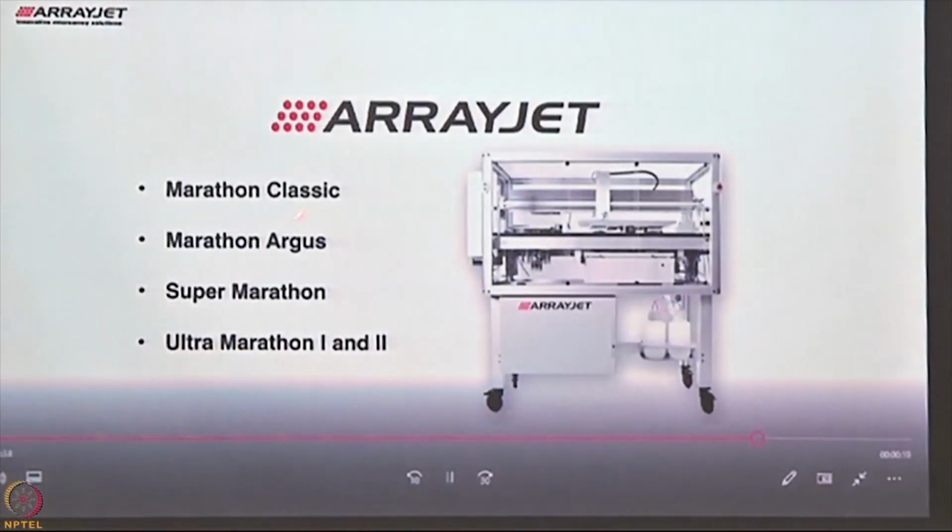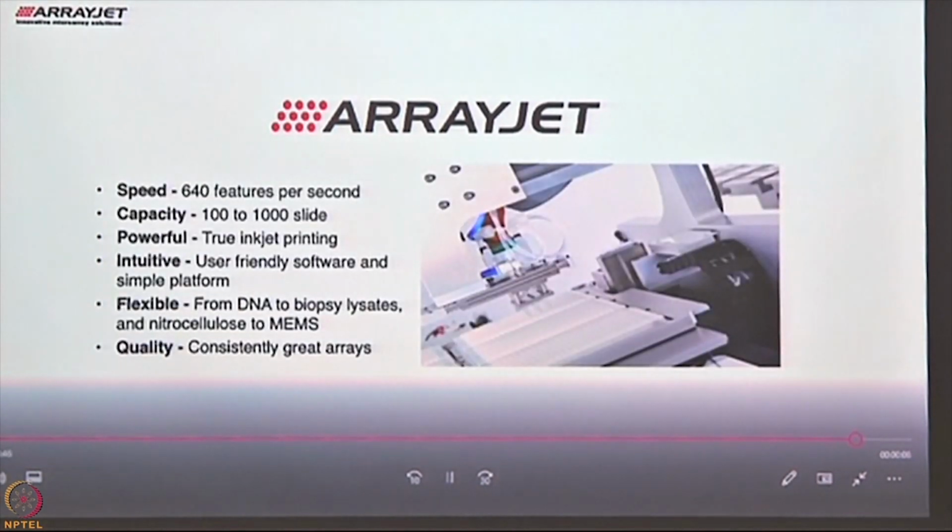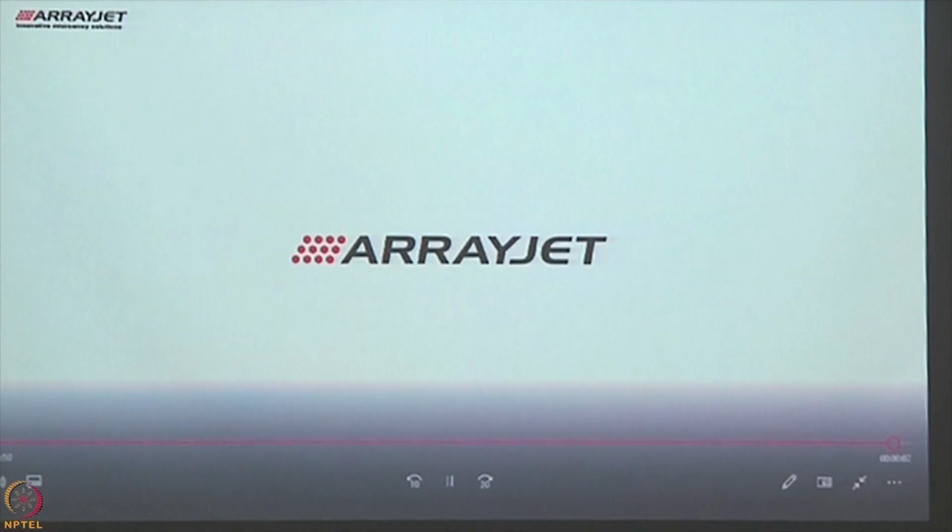Once it's finished doing it, it obviously has a standby mode where it is able to wash itself. So many people must be concerned, how do you avoid contamination? Is it contaminated if you're picking up another sample? No, it has its own individual wash cycles. So it does washing automated, so the whole thing is automated. It not only does the washing, after every time it picks up a new set of 12, it washes internally, and once the washing is complete, it makes sure that your new set of samples is going back in.